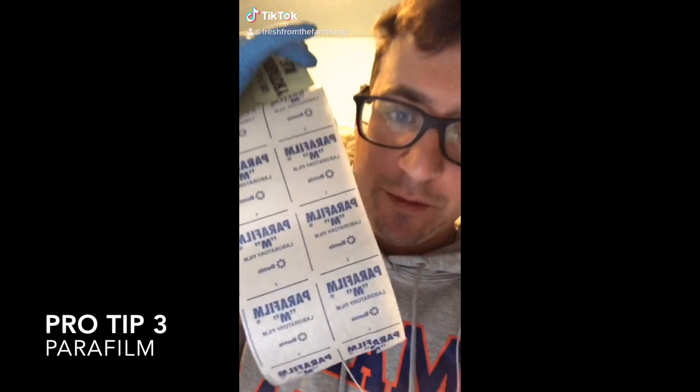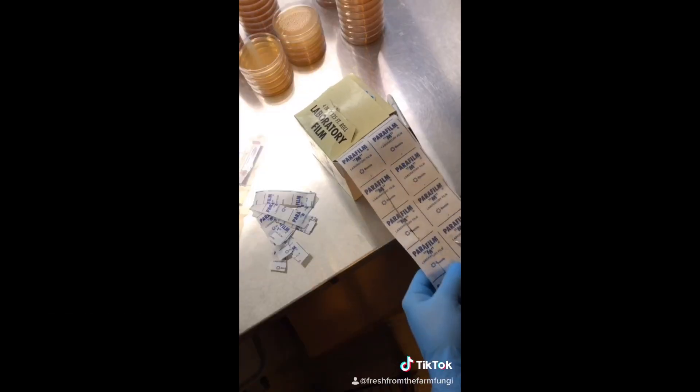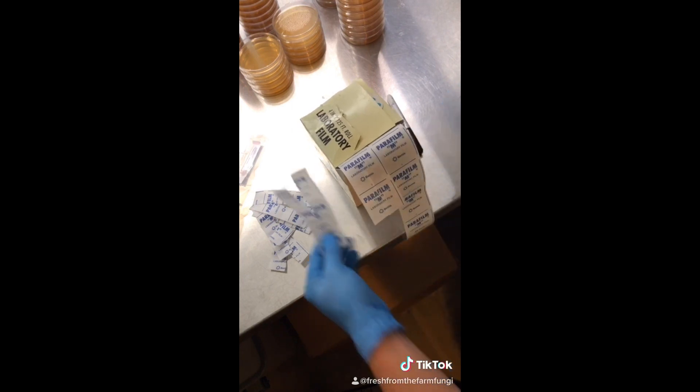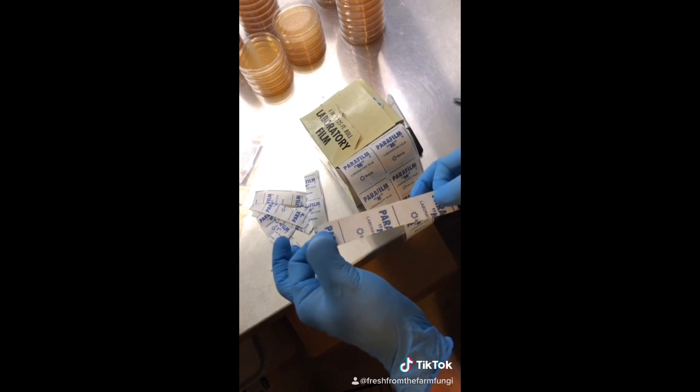Pro-tip: parafilm. Cut your parafilm into three strips, two wide, and you'll save a lot of heartbreak from it breaking on the plates.